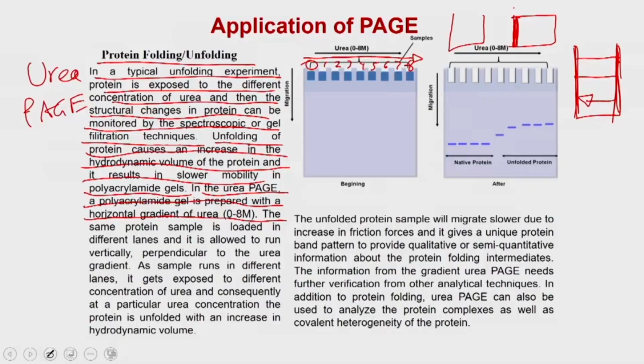And now I am putting in urea of different concentrations. I first put normal acrylamide, which is 0 urea, then I put 1 molar urea, then 2 molar urea, then 4, like that, and then we complete the 8 molar urea and the whole casting is over. So, I have not put the stacking gel so far; I have just put the resolving gel containing different amounts of urea.